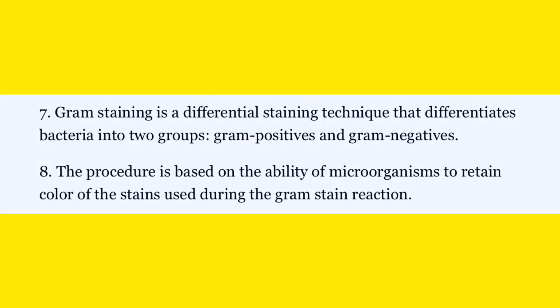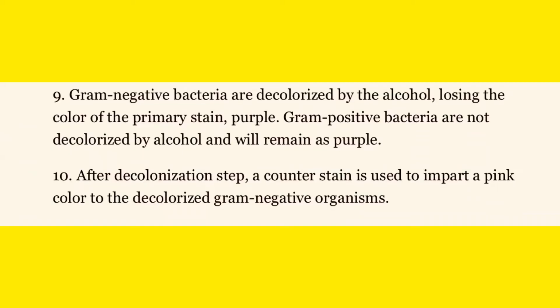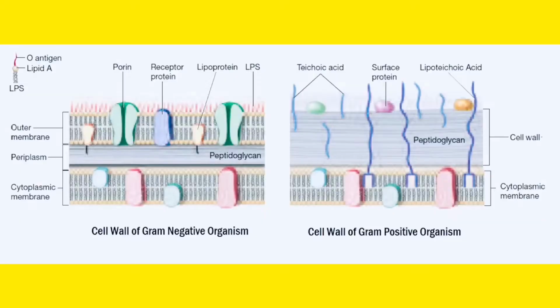This is the gram staining process on the basis of cell wall morphology. It is a cell wall differentiation into gram negative and positive bacteria. We will describe all the details in a later section. Bacteria are stained using a colorizing agent, a decolorizing agent, and a contrast stain, so we can find out the color of the bacteria. This is the cell wall of positive and negative bacteria. You can see there is a lot of difference in their structure and morphology. So now we will start.